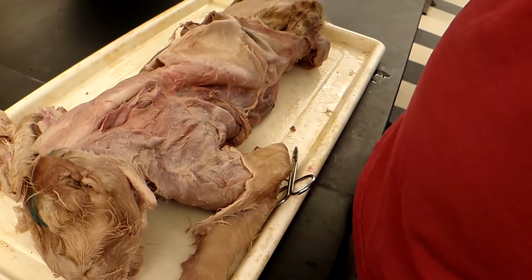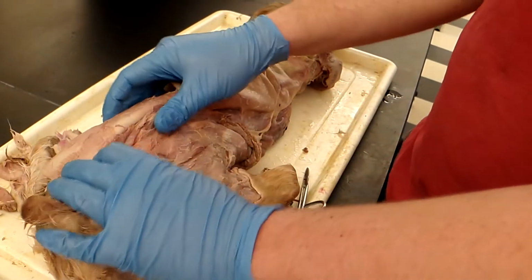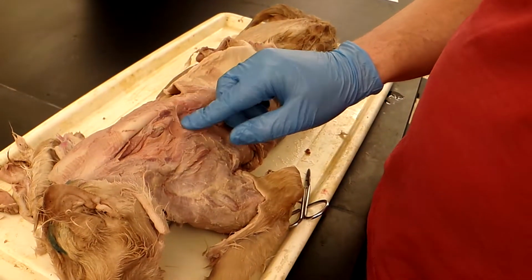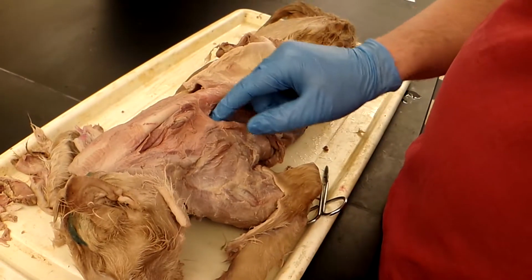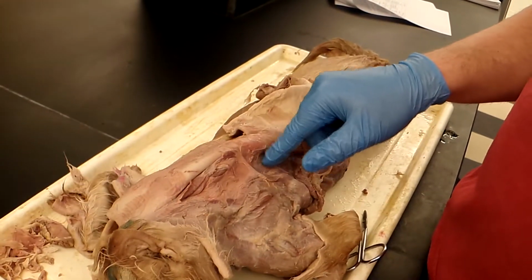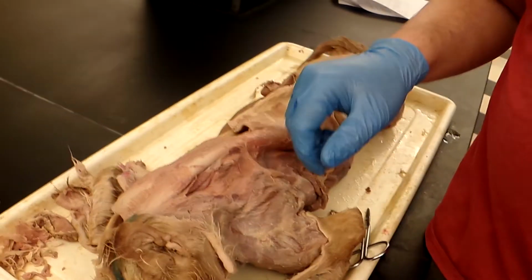Next is the spinotrapezius, which is located even farther behind. The scapula right there. Located right back here below the fat. Right back here. And the origin is the spinous process of thoracic vertebrae. The insertion is the fascia of scapula, and the function is that it retracts and elevates the scapula.